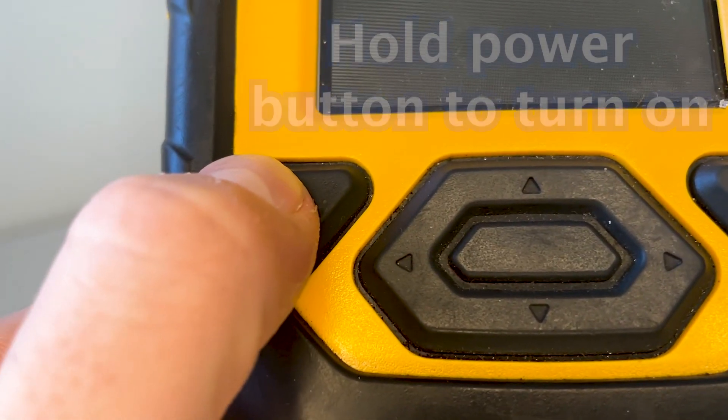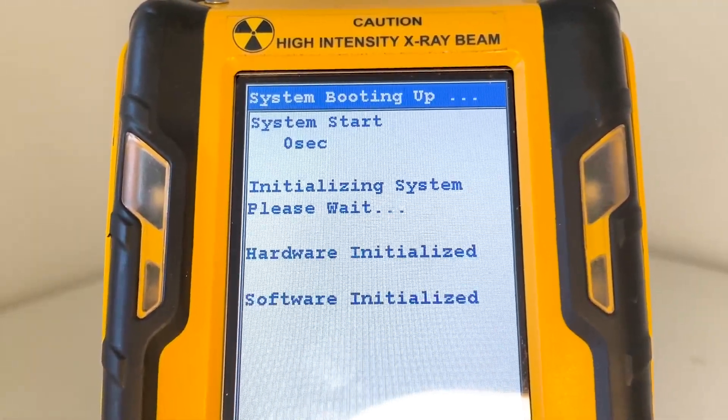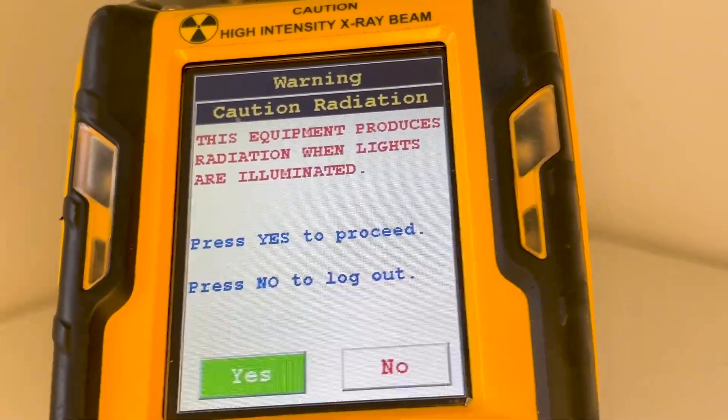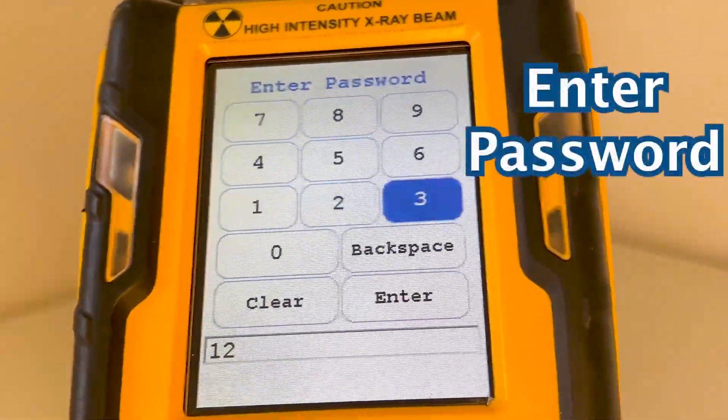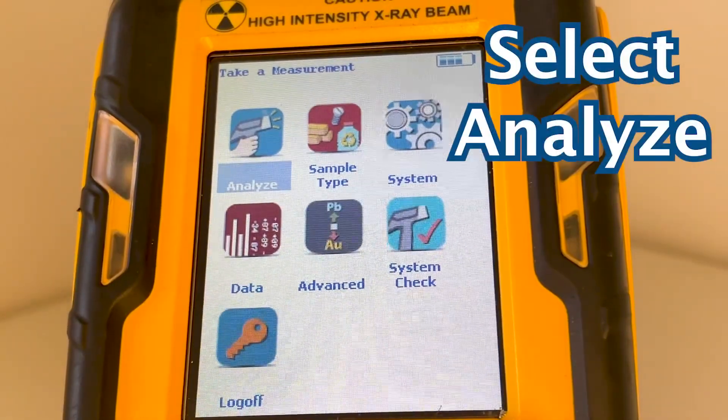First, hold the power button to turn it on. It will take a few seconds to boot up. Tap the screen to get started and hit yes to proceed. Now, enter the password. Select Analyze and you're ready to test.